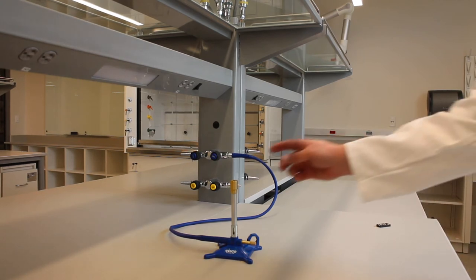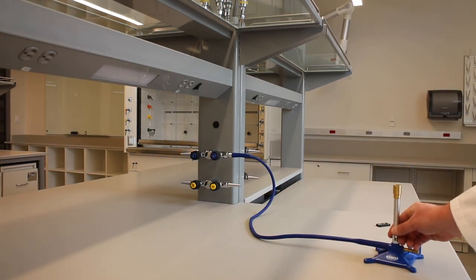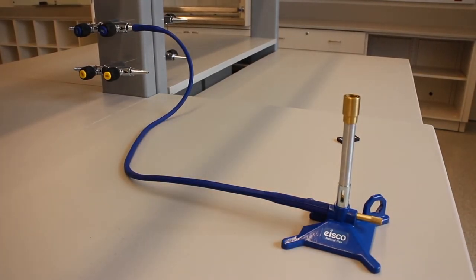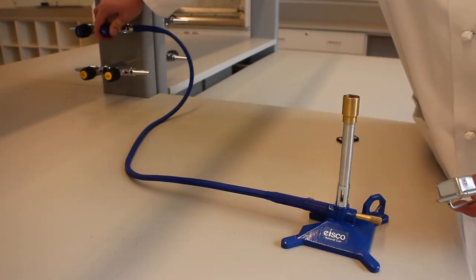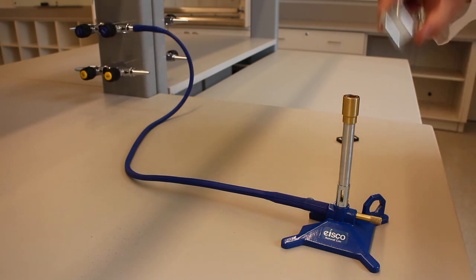Also make sure your Bunsen burner is not directly underneath any shelving or supplies. With the burner positioned away from overhanging items and fellow lab mates, turn the gas all the way on at the main control knob. Then, use the striker to ignite the Bunsen burner.